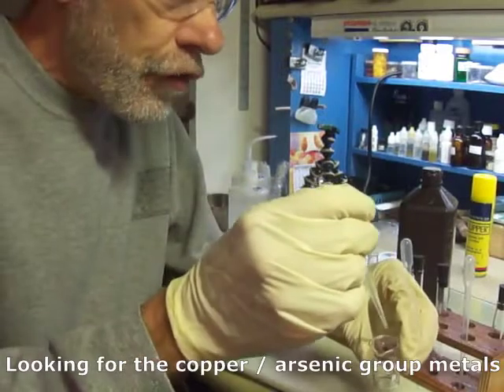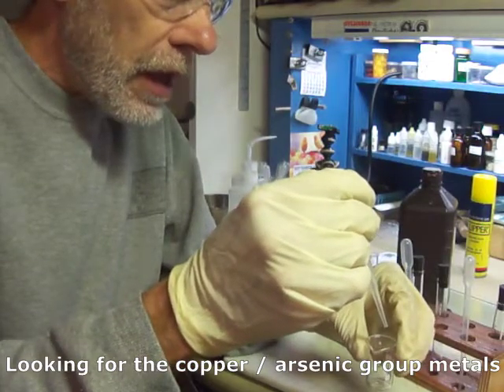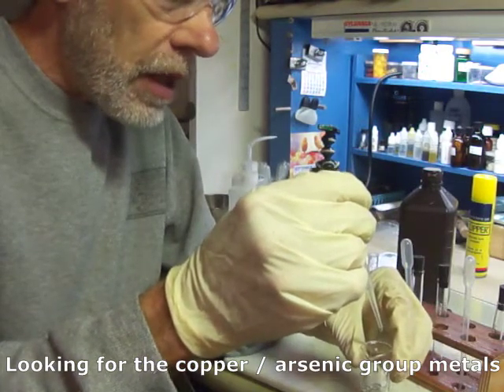But like this whole procedure, each step entails a whole bunch of sub-steps. It's basically bubbling hydrogen sulfide through and precipitating all these things out as sulfides, but there's a bunch of steps. So let's go ahead and do them real quick here. We have 4 or 5 drops of our unknown solution in, it says a casserole. I'm going to use a beaker.